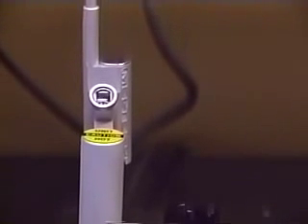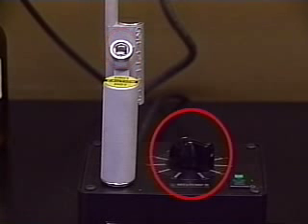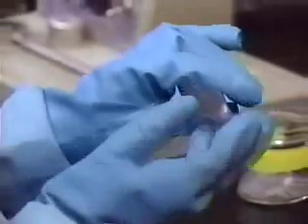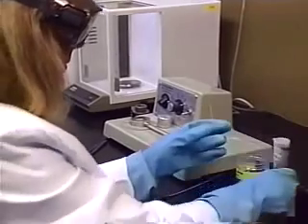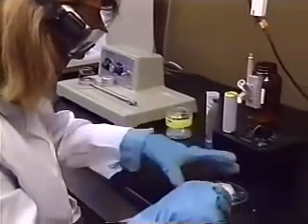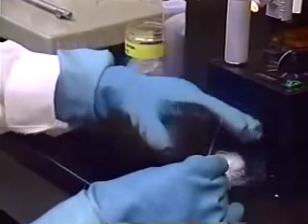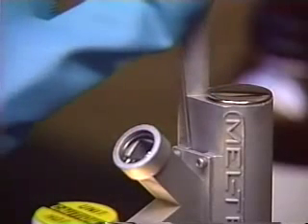Mel-Temp apparatuses are used in a manner similar to the Fisher-Johns. This is the eyepiece, the temperature control knob, and the sample holder. The sample is placed in a small capillary tube. To get the crystals into the bottom of the tube, tap it gently on the bench top. Place the capillary tube in the Mel-Temp as demonstrated.